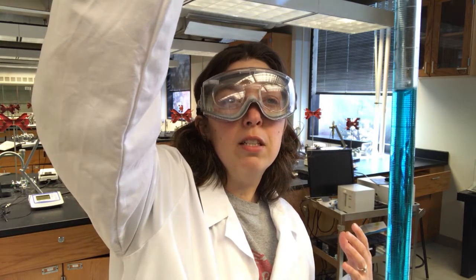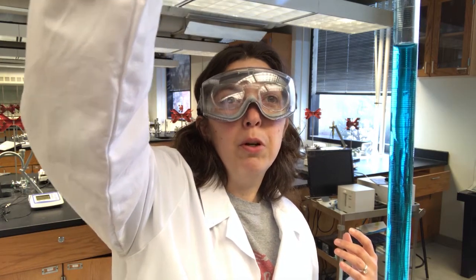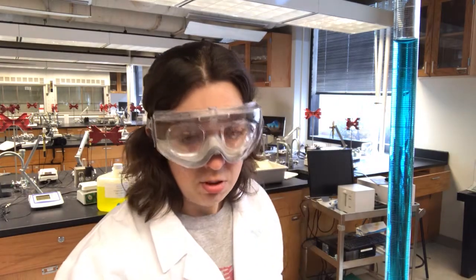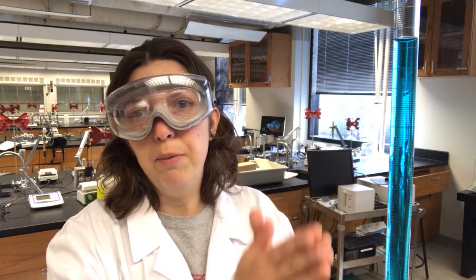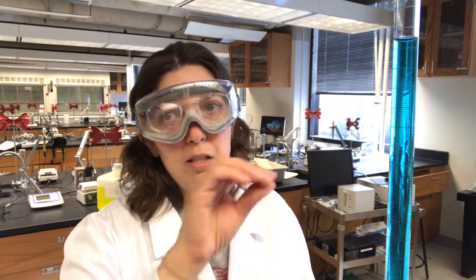One of the things that kind of drives me a little crazy is when people worry about starting a titration at 0. You don't need to do that. You can start the titration or whatever it is at any point along this burette, and it saves you a step. You don't have to worry about getting 0.00. That's really challenging to do. Okay, so skip that. Just get that out of your mind right now.